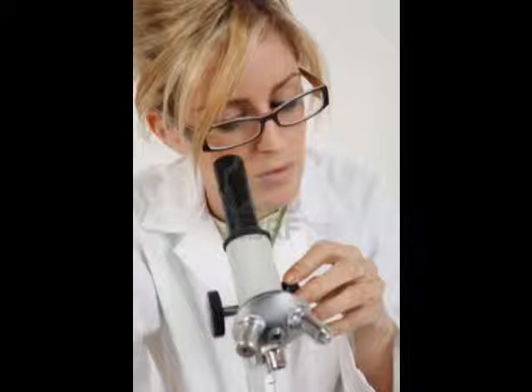The technician, you want them to be well-trained and follow the procedure exactly. And if possible, perhaps team members can critique each other on their sphericity and roundness readings and judgment and skill, and you'll get an accurate reading.